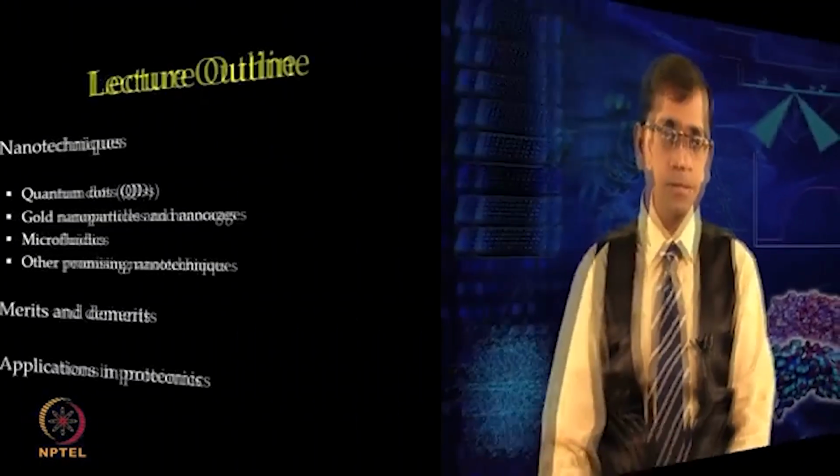In today's lecture, we will continue our discussion about nanotechniques in proteomics. We will discuss a few nanotechniques such as quantum dots, gold nanoparticles and nanocages, and microfluidics.